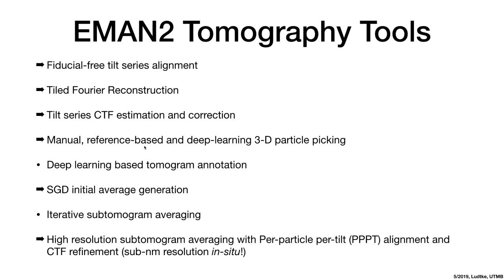This is something that existed previously. I may have even mentioned it briefly when I gave the last talk 2 years ago. This is deep learning-based 3D particle picking. So we use neural networks: you train up a neural network to identify features and then extract them. And I'll say a little bit about that again today.